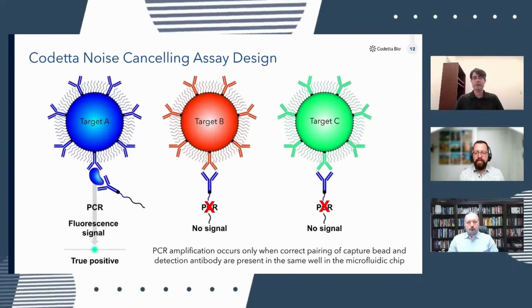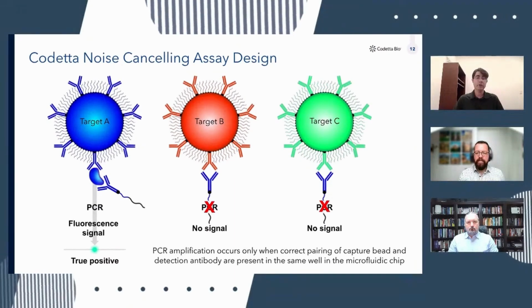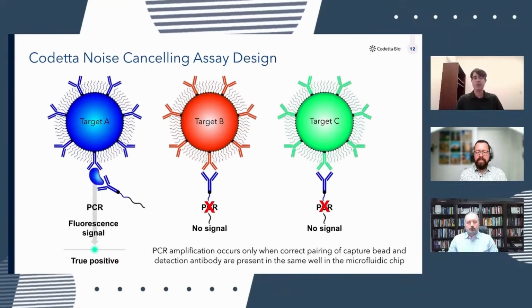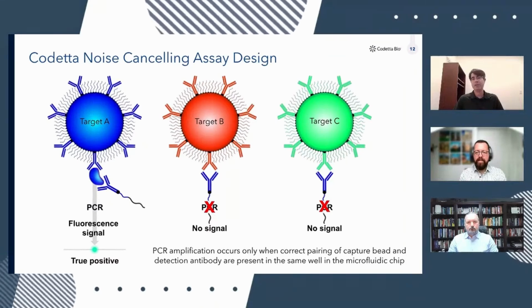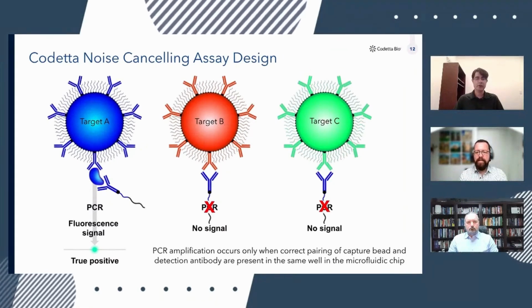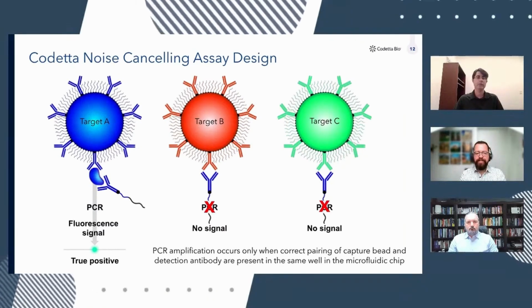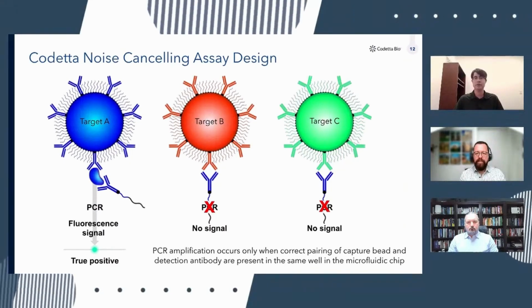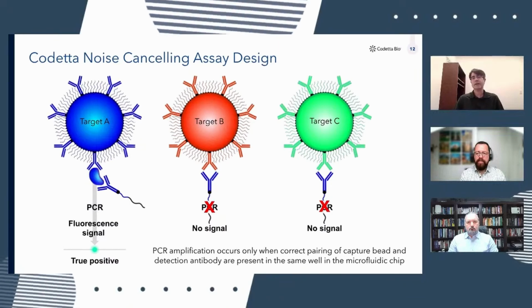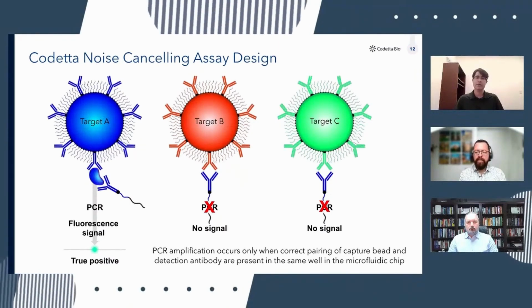So in this case, with 3 target beads, target A has an immunocomplex formed with the correct pairing of capture and detection antibody. And again, because the forward primer on the bead amplifies the unique DNA barcode tag, that creates conditions that are conducive to PCR, and the resulting PCR amplicons are detected through the fluorescent intercalating dye, so a true positive reaction.